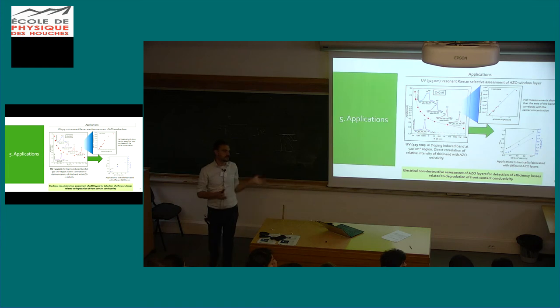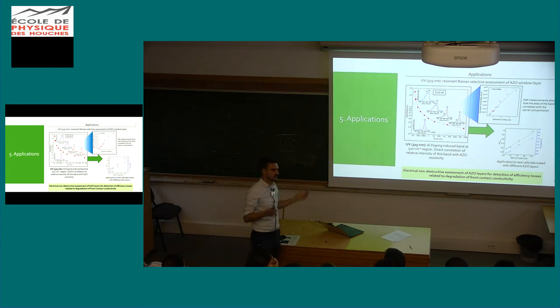It's because in this particular case we can use it. Maybe in another case it's useless. But it's never quantitative by itself, Raman. You always need another technique that helps you to transform it into quantitative.